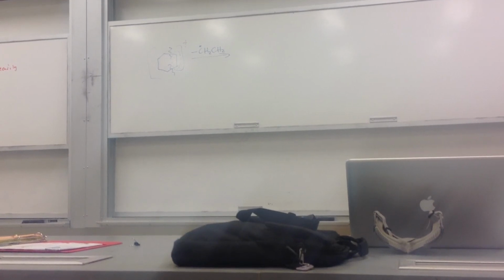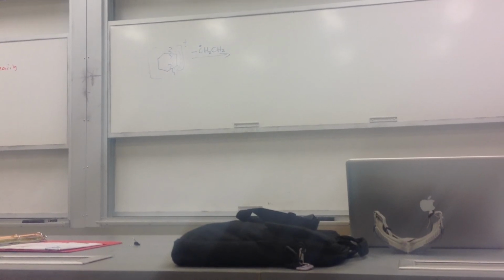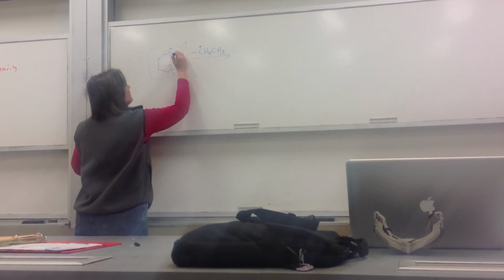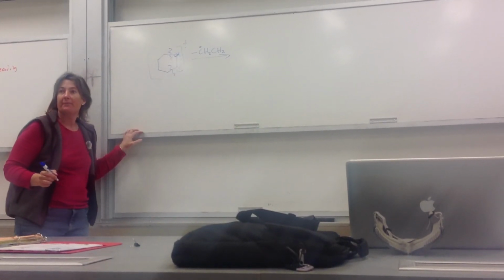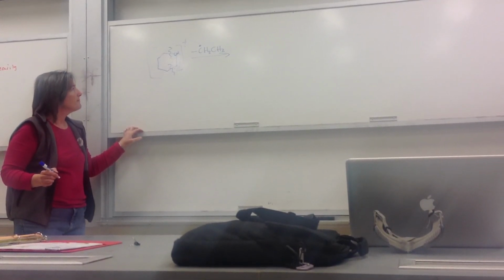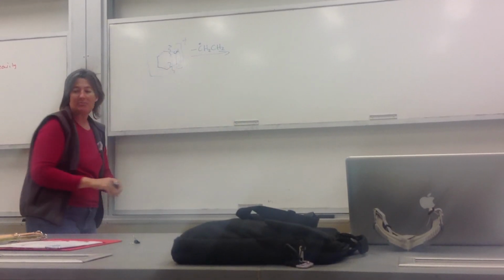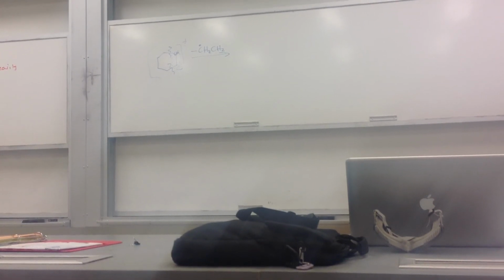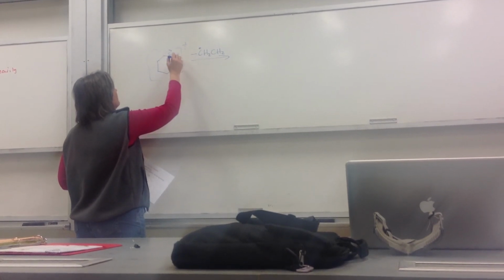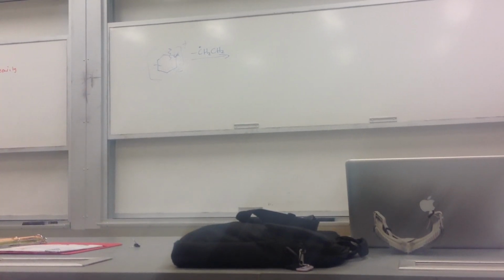Yes? So when that propyl group breaks off, there's obviously that carbon on the ring, that's just a CH by itself. It is just a CH, that one exactly. It doesn't break off like in this part. Right, so what we have, this right here is a CH at that point. So shouldn't it be minus CH, CH2? Let's go ahead and, yeah, I want to actually leave that piece there. I'm pretty sure I want that CH to be there. Let's break it somewhere else, because it does lose a CH2, CH2. So if we broke our propyl there, let's chunk that out. Okay, I'm going to lose a CH2, CH2, that's what it does.